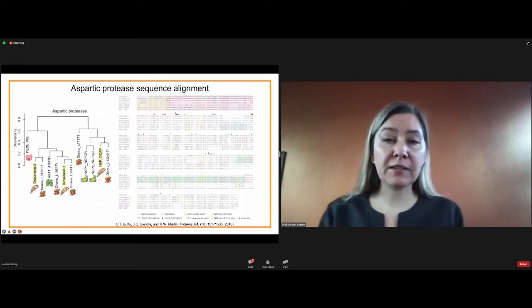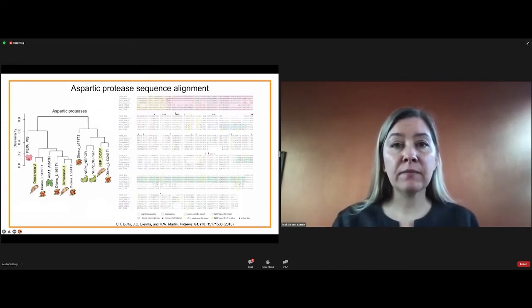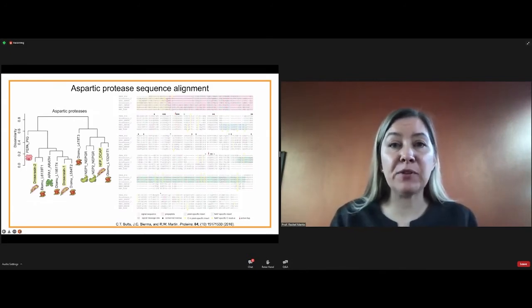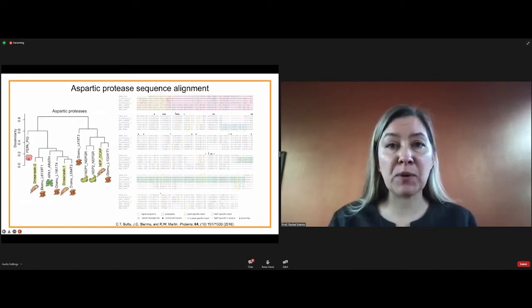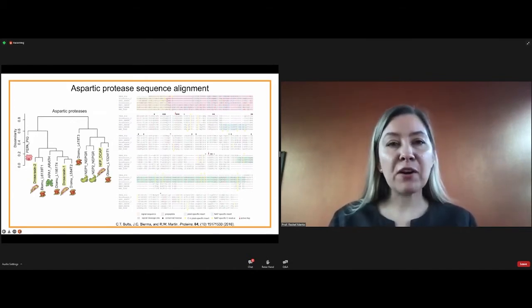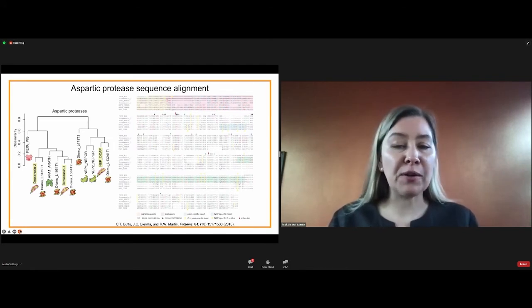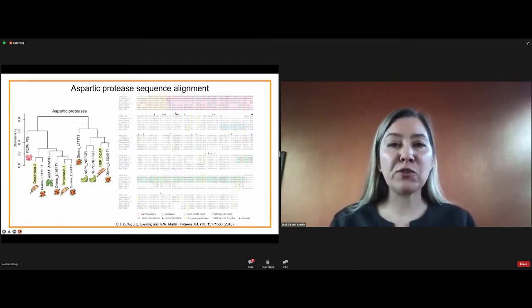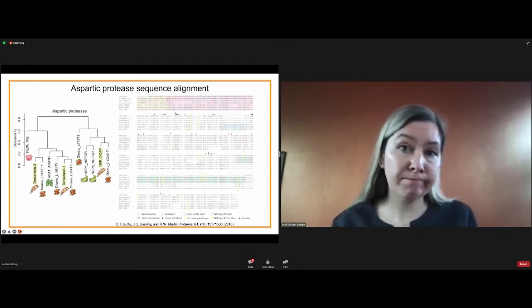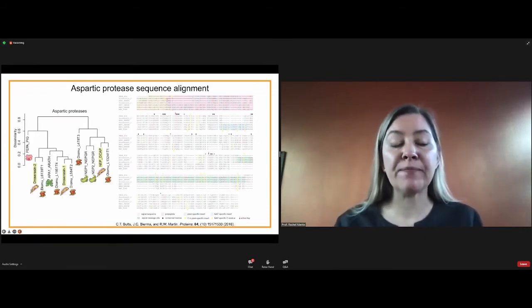All right, so that's just one protein, and you could run with that. Honestly, you could take the whole thing and go and start expressing that protein and use it for NMR. But there are some other things that we can do too. So one way to choose your target is just to say, okay, which one is most highly upregulated in the plant, and that's a fine way to do it.